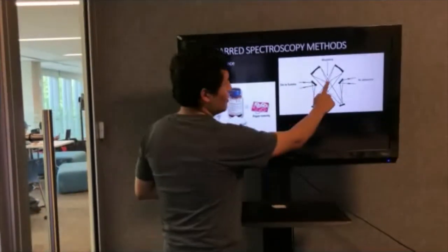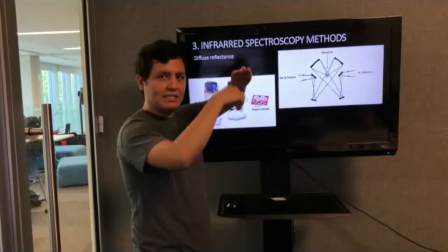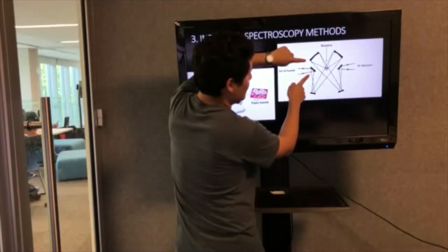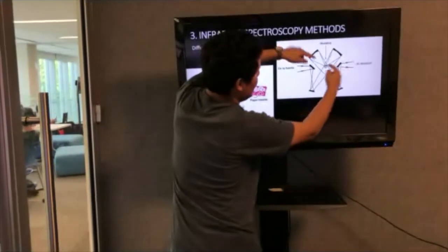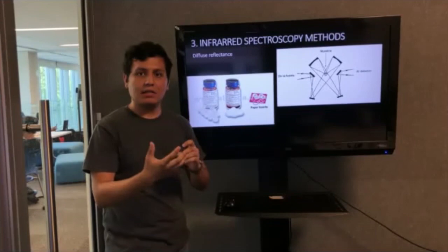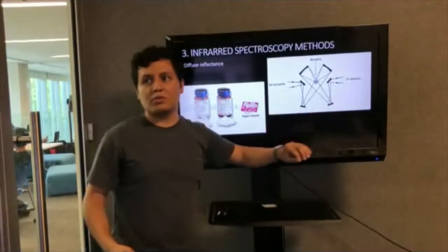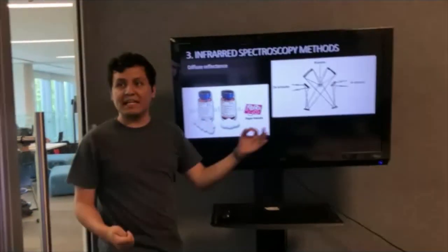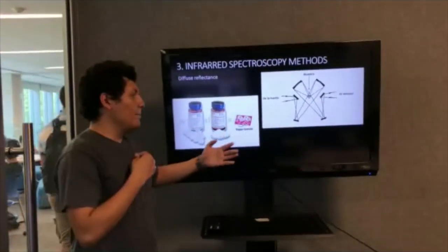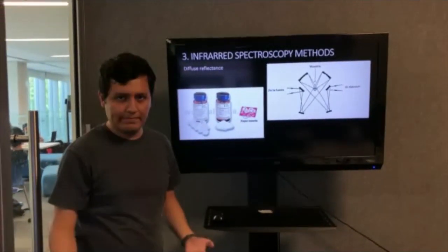Now, we put our sample in the middle of two mirrors that will make all the light pass through to a single point. We shoot two initial beams at them, and they will pass through, thus catching all the diffuse irradiance caused by the sample. And finally, it will reach a detector. This detector will be able to make the same spectrum as the others, but this takes maybe a little too much time for what we have.